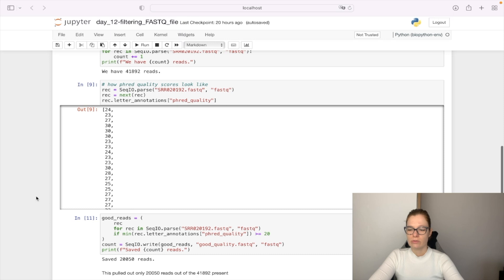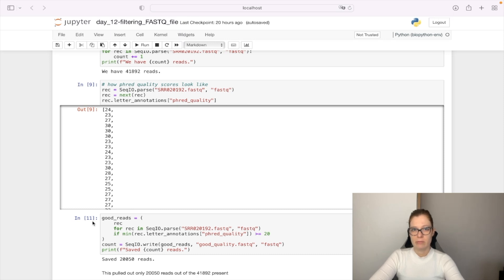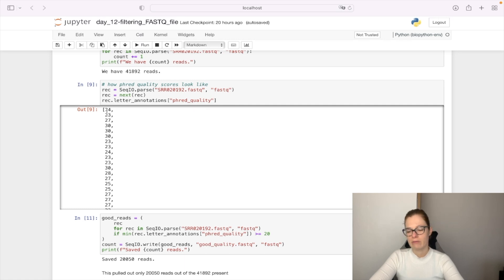What we're going to do is filter out only those sequences where the minimum quality score is greater than or equal to 20.